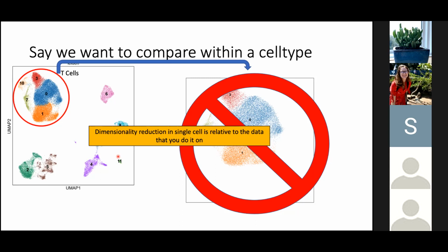So certainly what you can do is I could go and look at skin data sets and ask, how did they cluster theirs? And did they find any biological significance there? Right, that's certainly one approach that you can use. I actually think that, again, clustering is super hand wavy. There might be better ways of doing this.